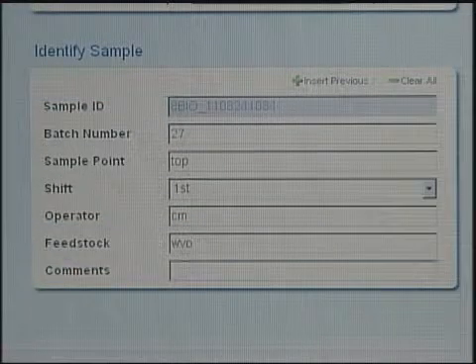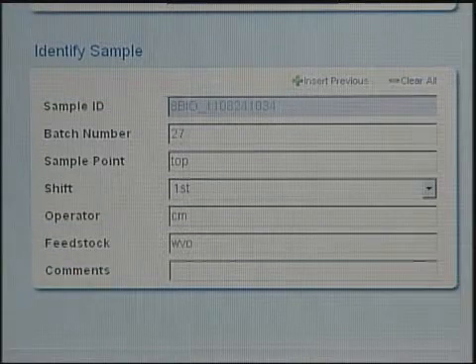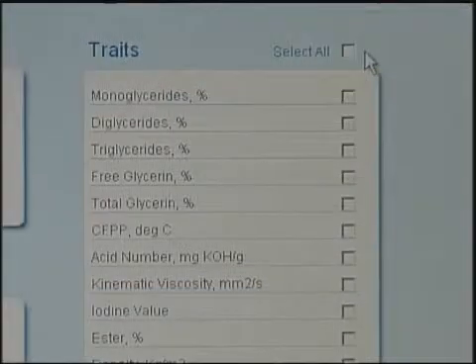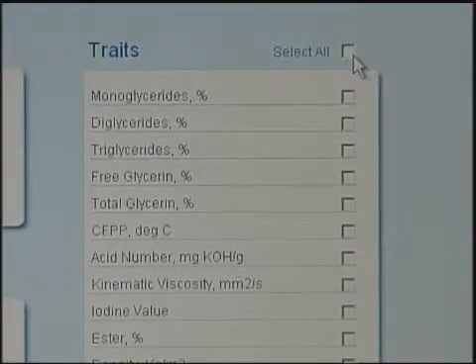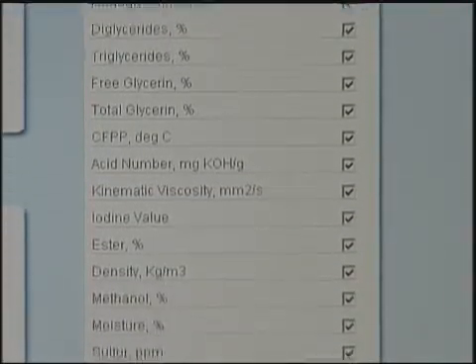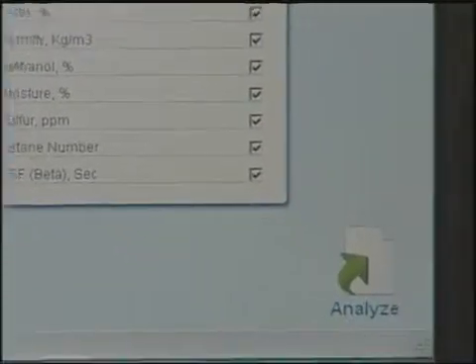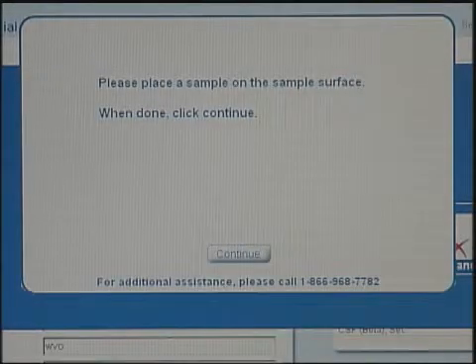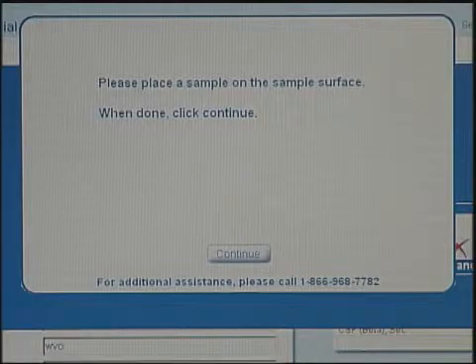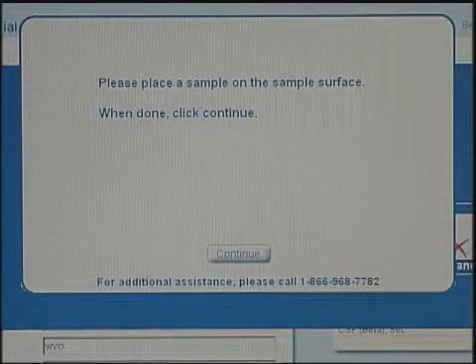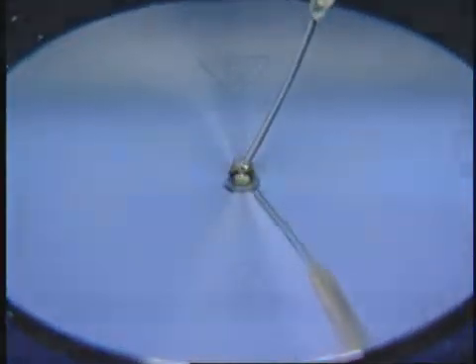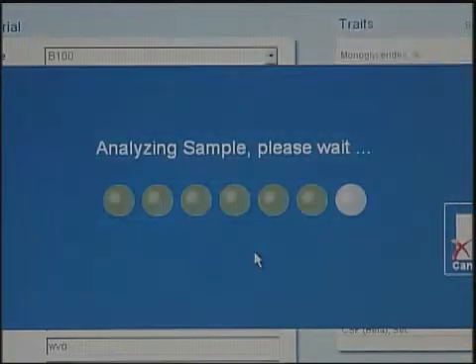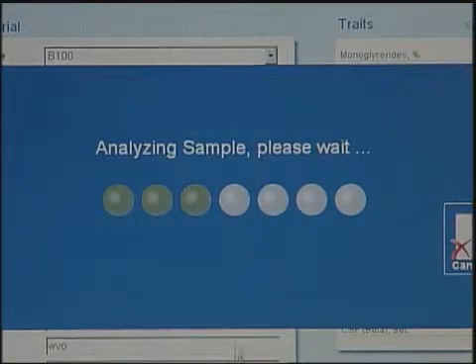Next, identify your sample by typing in a variety of customizable options. Then check the traits of interest — you can choose as many or as few as you'd like. Click Analyze and the system will prompt you to apply the sample to the center of the surface. One small drop is all it takes. Finally, press continue and the analysis will begin.